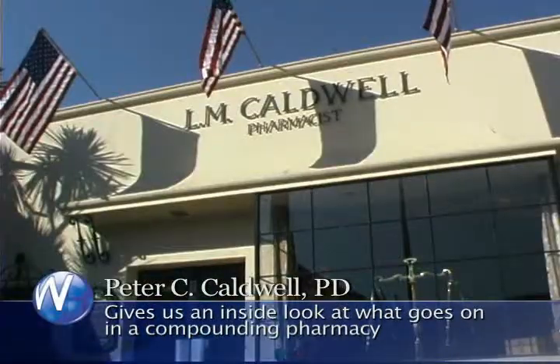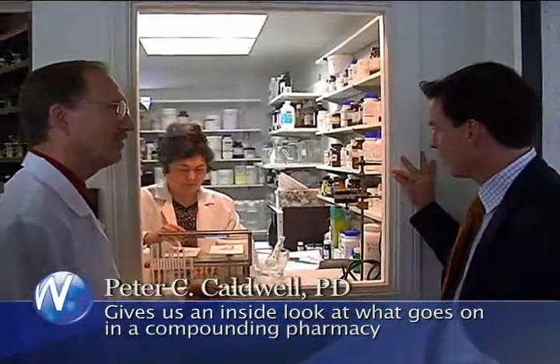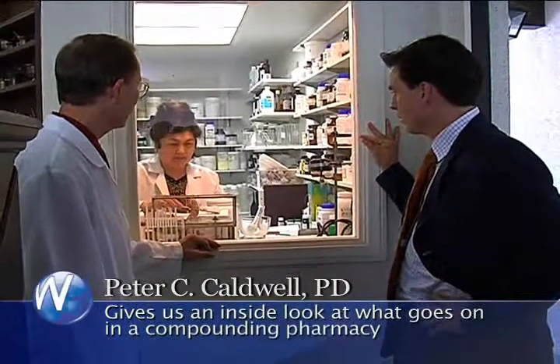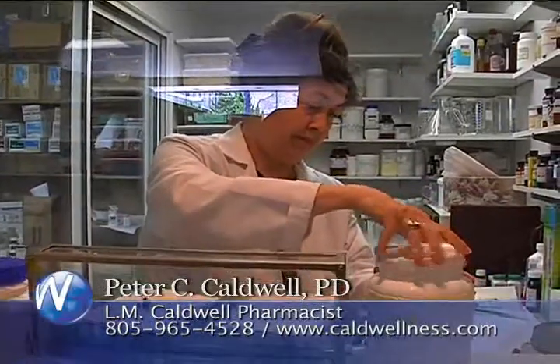Okay. Welcome to our compounding laboratory, Randy. All right. This is it. This is where we prepare all of the compounded prescriptions that are ordered by the physician. So what is she making? At this time, we're making an oral capsule specifically for a patient order.